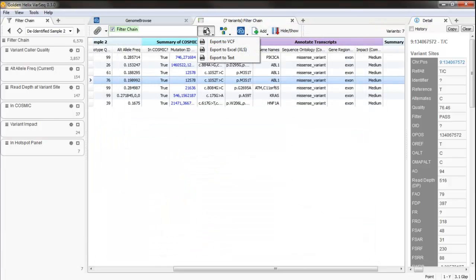You can export the data. And that's really what this is about, is making this simple. And as you can see, in a matter of really seconds, I was able to start the workflow and get to the point of starting the test interpretation process. Okay, I'm going to come back to this project as I go through into the next section.